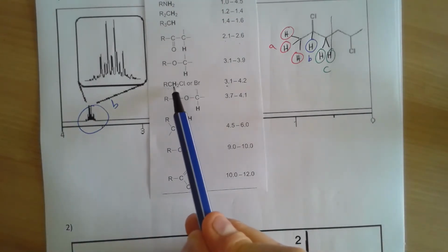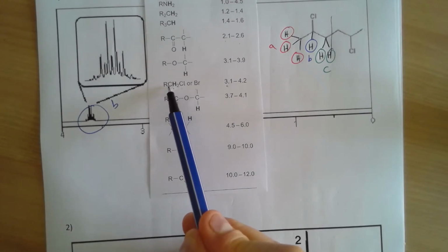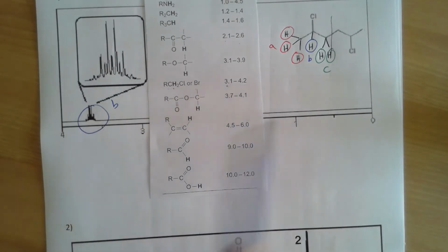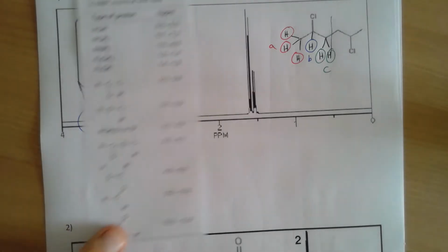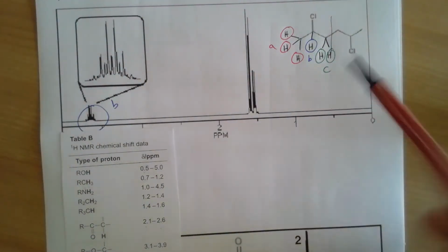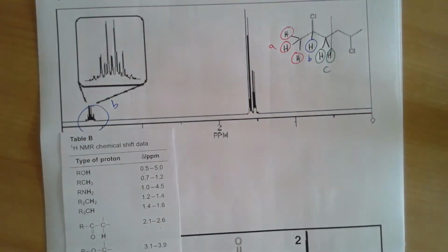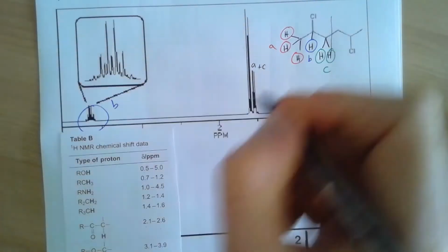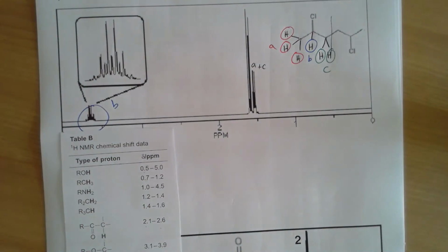So the hydrogen there, which is attached to the carbon, which is attached to a chlorine, we expect to see between 3.1 and 4.2, which is that range there. So that was a good guess. For environments A and C, for the moment we're not going to worry about how we'd resolve these and work out which one is which. We'll do that when we have a look at splitting, but we're going to expect to see them, environments A and C are going to be these two here.